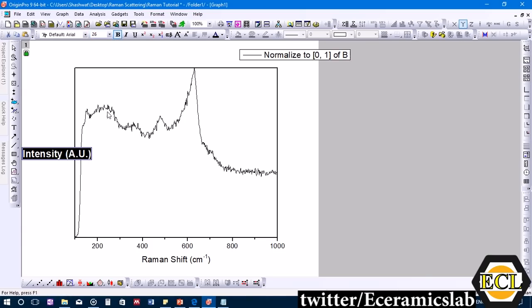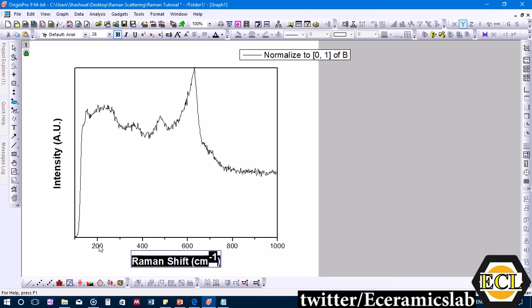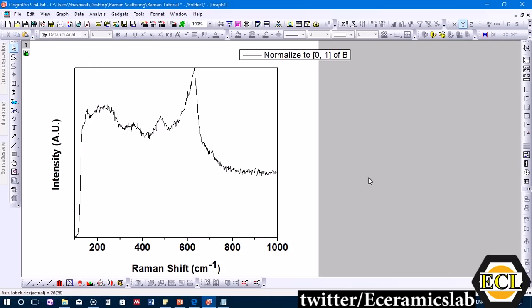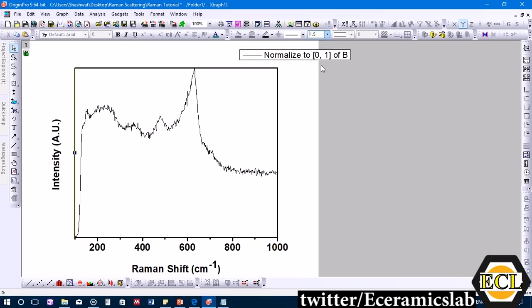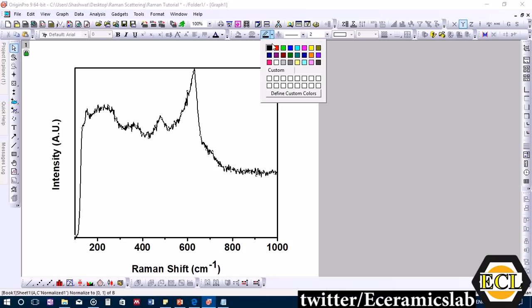For presentation purposes, we make the labels bold at font size 26, make the axis lines thicker at size 3, and make the curve thicker at size 2. We also change the curve color to dark blue. This formatting is purely for presentation quality.